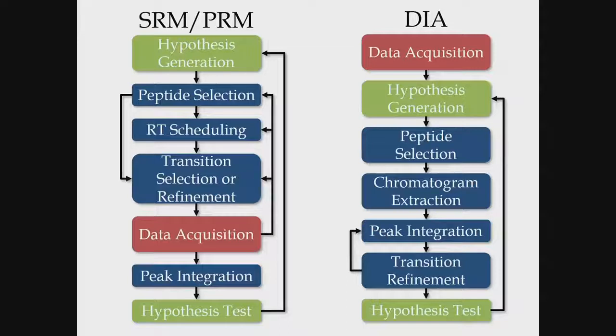So these are sort of things that we began to do quite regularly. And while we don't offer a core service, we found that if we did offer a core service, I would have thought this would be particularly appealing because you could collect the samples once, you could train your users to analyze the data, sort of like how you're learning here, what Brendan's doing with a tool like Skyline, and they could then, in theory, go back and remine their data over and over again. Does that make sense?